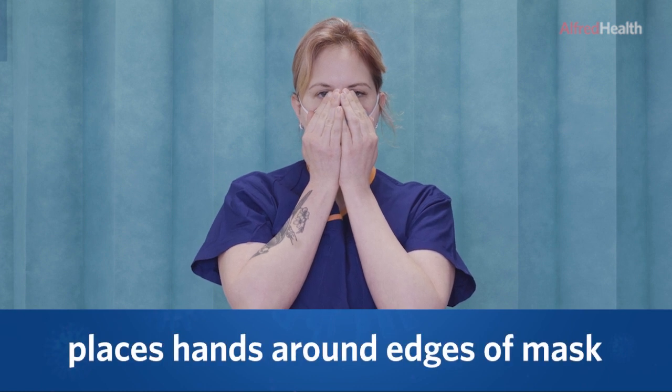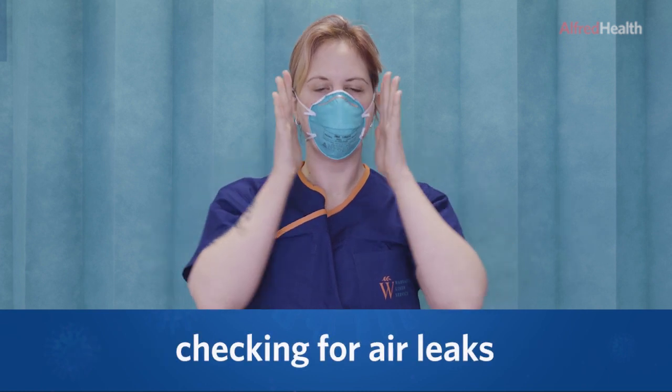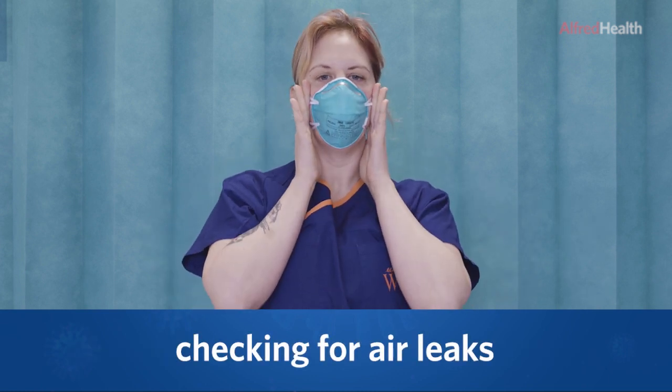Continue on by placing your hands around the edges or sides of the mask, checking for any further air leaks on exhalation.